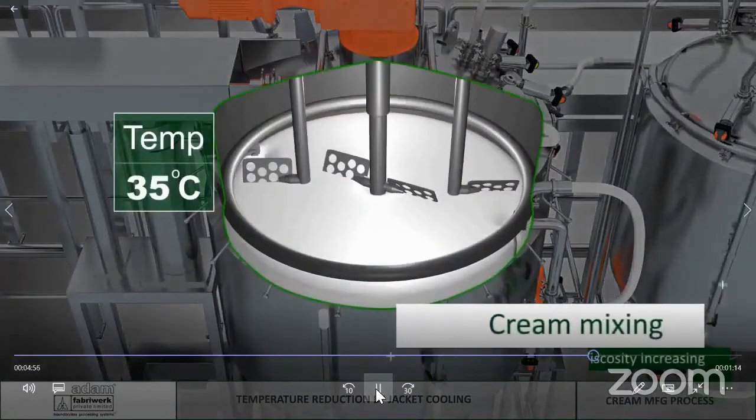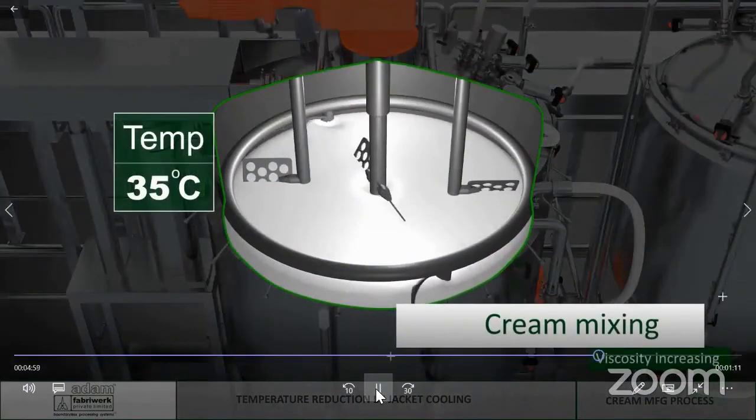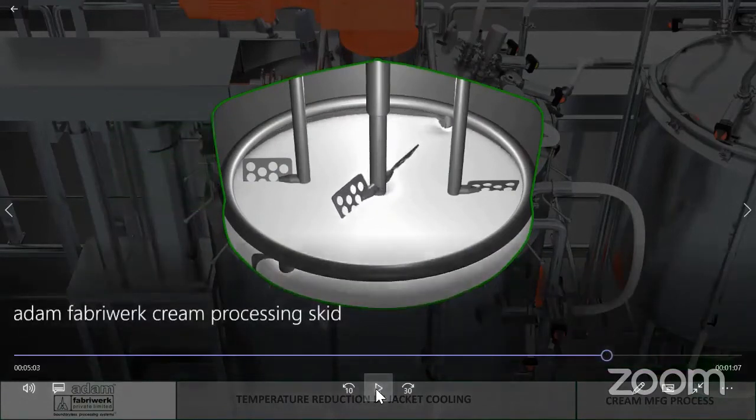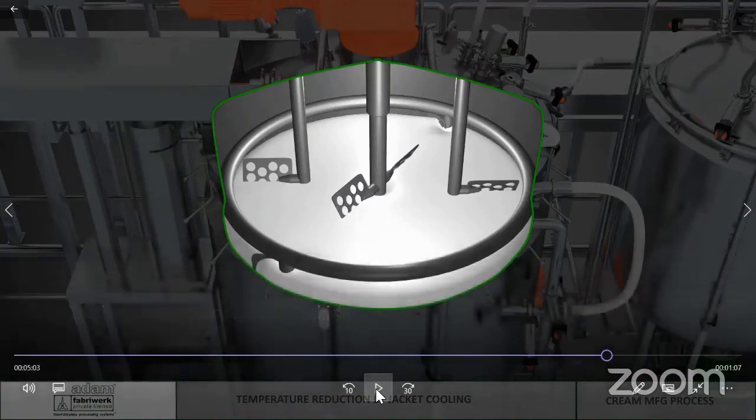Once the product is cooled down, you can see the anchor moving very slowly to ensure that mass movement is carried out. This moves the product within the vessel and it is scraped from the walls. It is very important to note that the high shear is not operated once the emulsion formation is done. Over-operation of the high shear may also lead to low viscosity or damage the product.